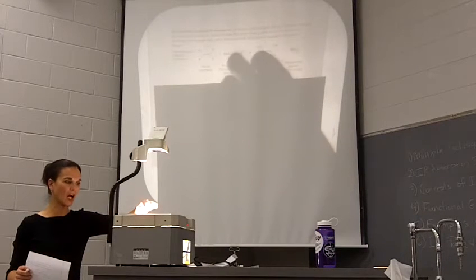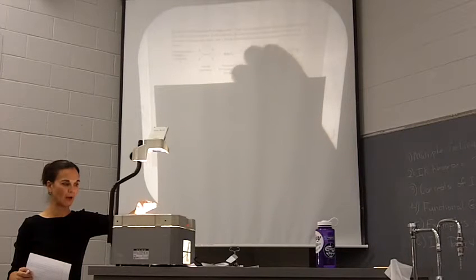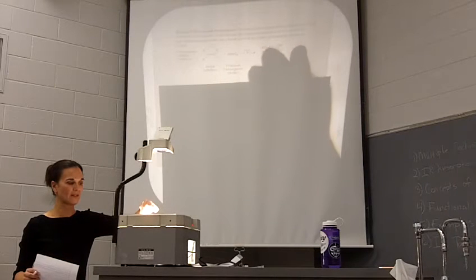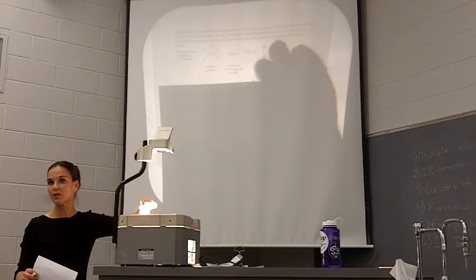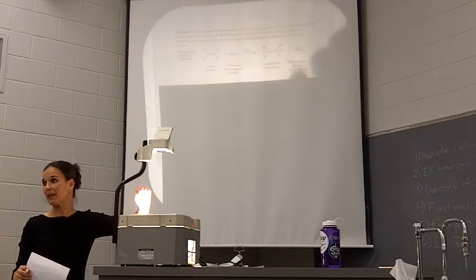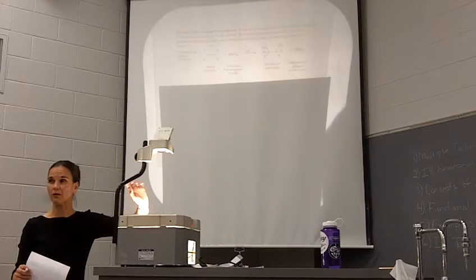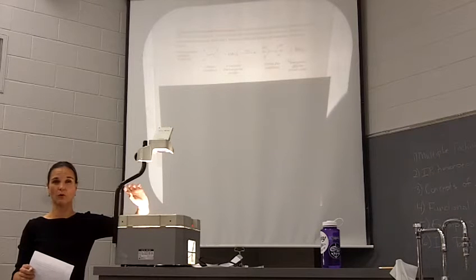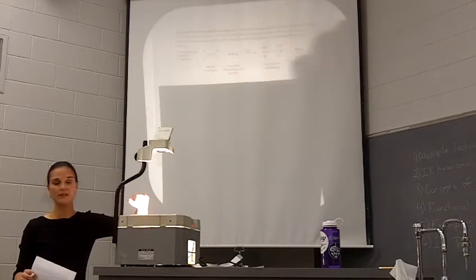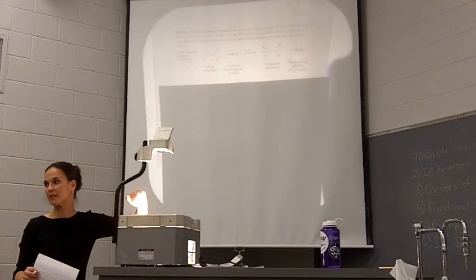So you're decolorizing because you're getting this reaction of the potassium permanganate reacting across the alkene, and you're forming this solid, which is a brown solid. So what you should see with this test is you add that potassium permanganate. At first it's purple, and then that purple starts fading and either going away or turning more red, pink color, not so purpley. And then you start seeing signs of this brown solid forming. That's a positive potassium permanganate test.